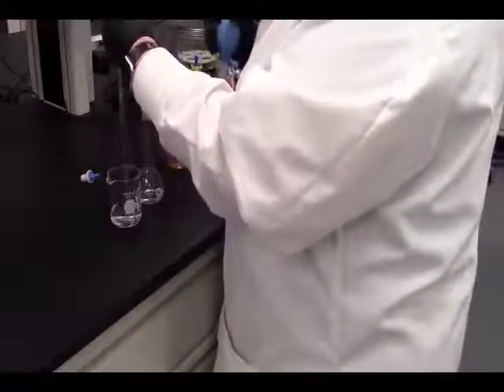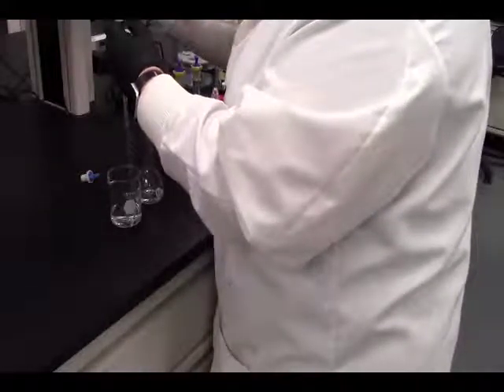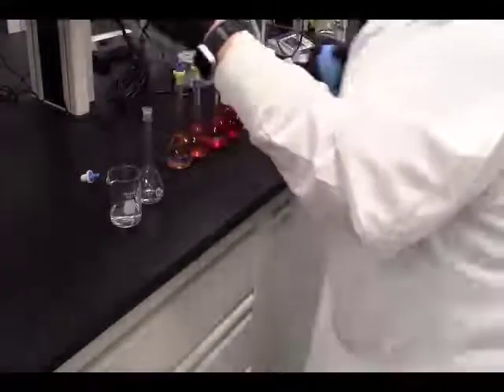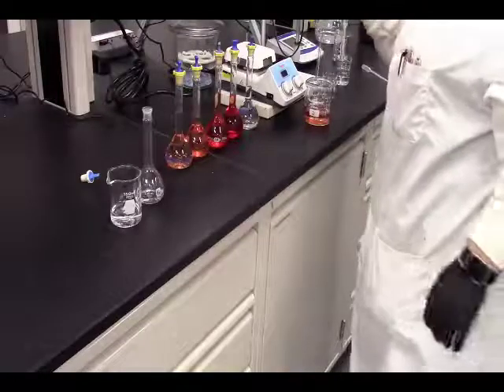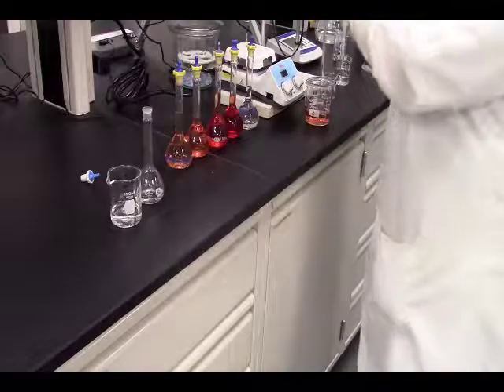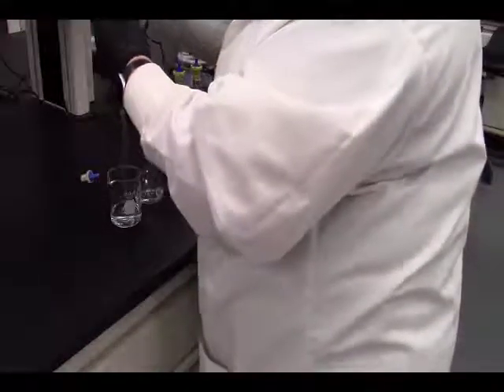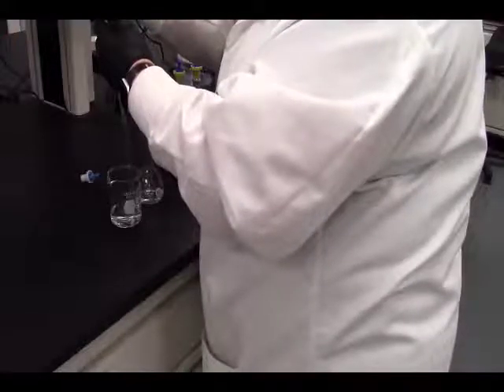All right. The first standard sample requires 1 milliliter of our stock. Our stock was made by a former classmate. You can see how to make that. The first thing we're going to do is rinse our volumetric pipette as per analytical techniques. Okay. Then we are going to do this correctly and take the pipette bulb off before you do that.